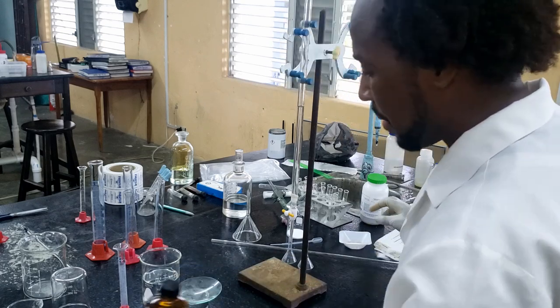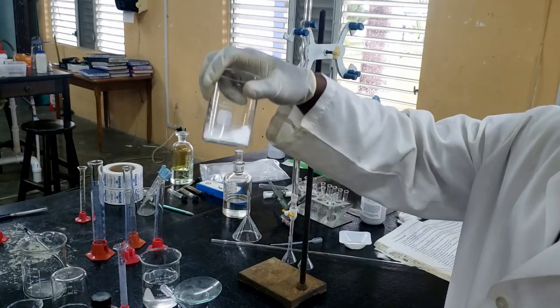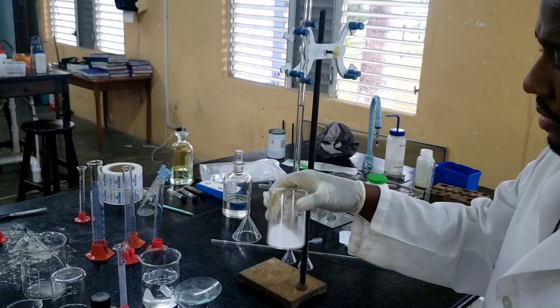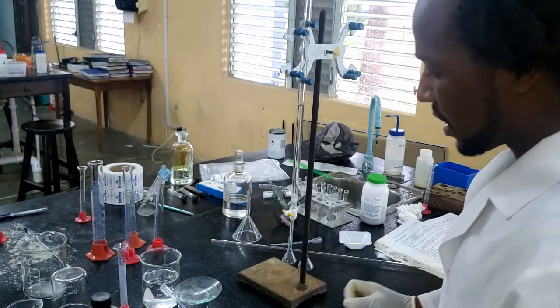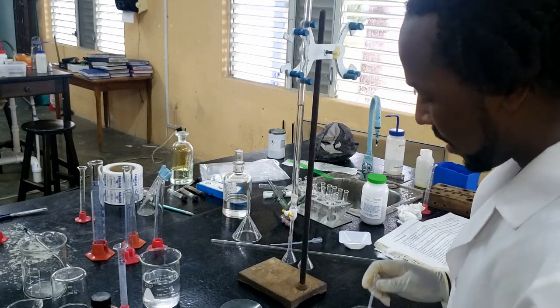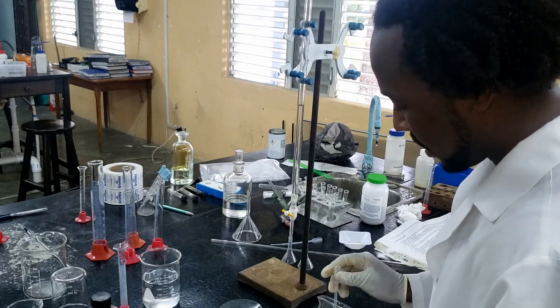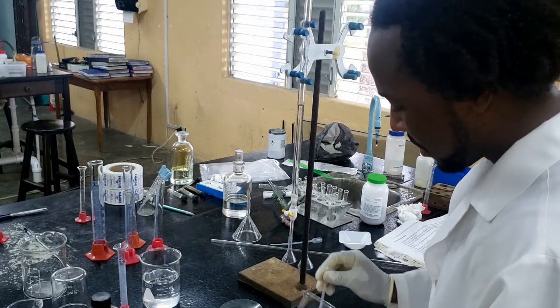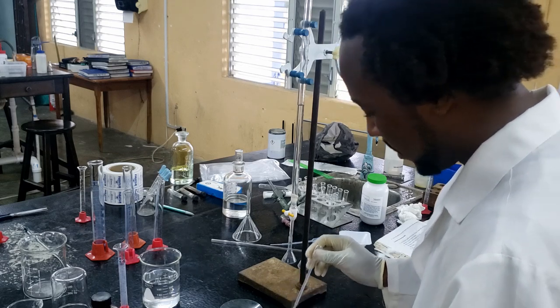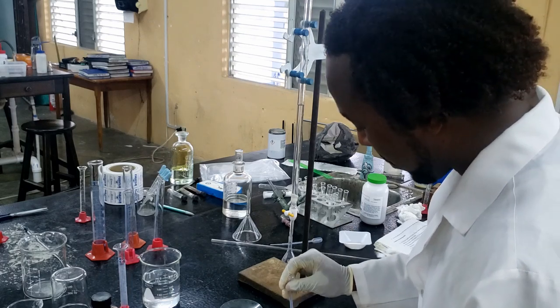And now we need 6 grams of silica. So the silica gel desiccant is a white powder. We want to make a slurry from the silica. So something like a slush, we're going to use the same eluent. And we're going to add to the silica just until it turns sort of smushy looking. You want to be able to pour that silica into the burette.